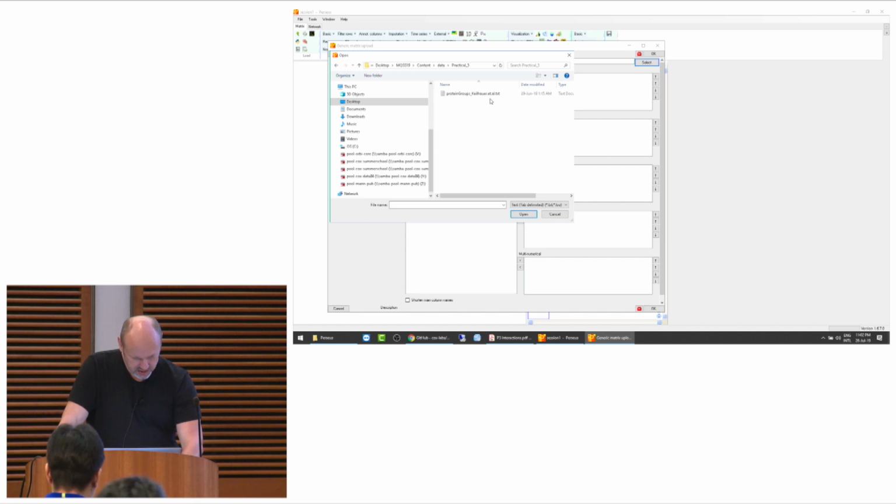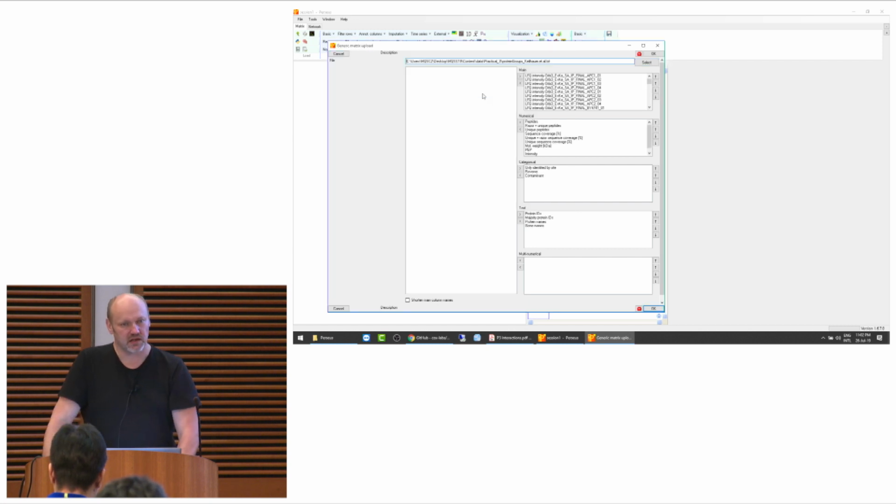And there is this protein groups file, Keilhauer et al. That is what a typical protein groups file would look like from a MaxQuant output, where you have run all of these pull downs, and let's just load it. As you see, there is actually nothing left in this field here.